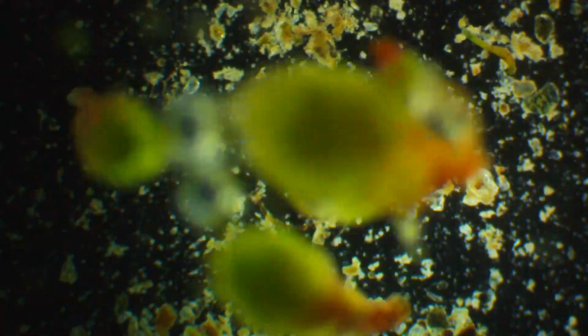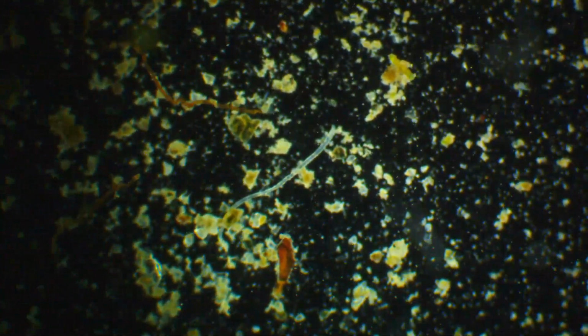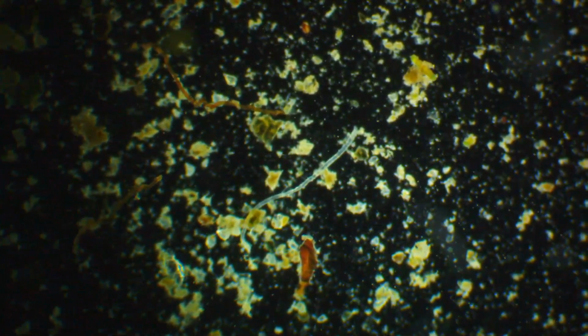Well, that's a big chunk of moss just floating on the surface there. That almost looks like a worm, but it's not moving. Could be a dead worm. Lawnmower scan.